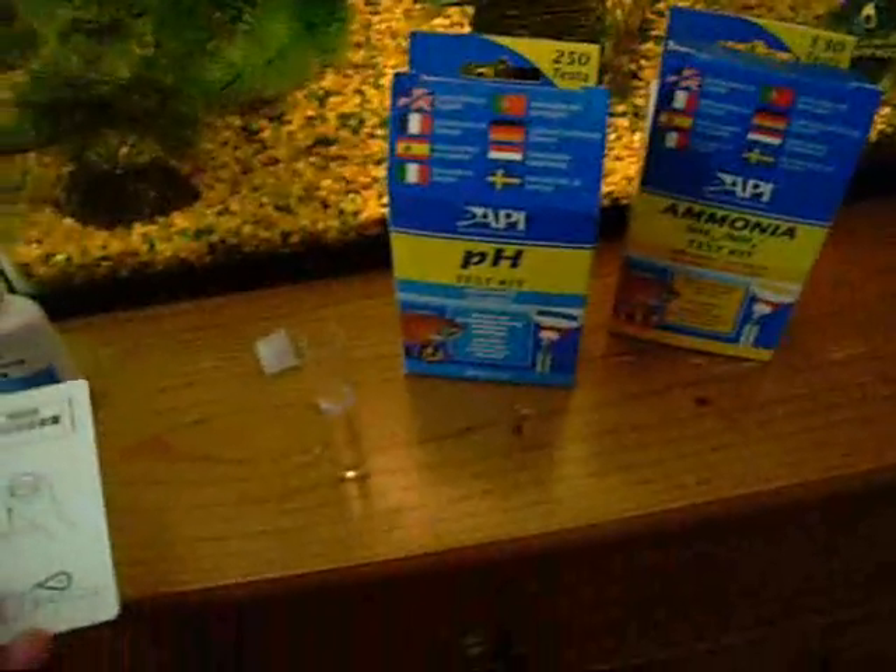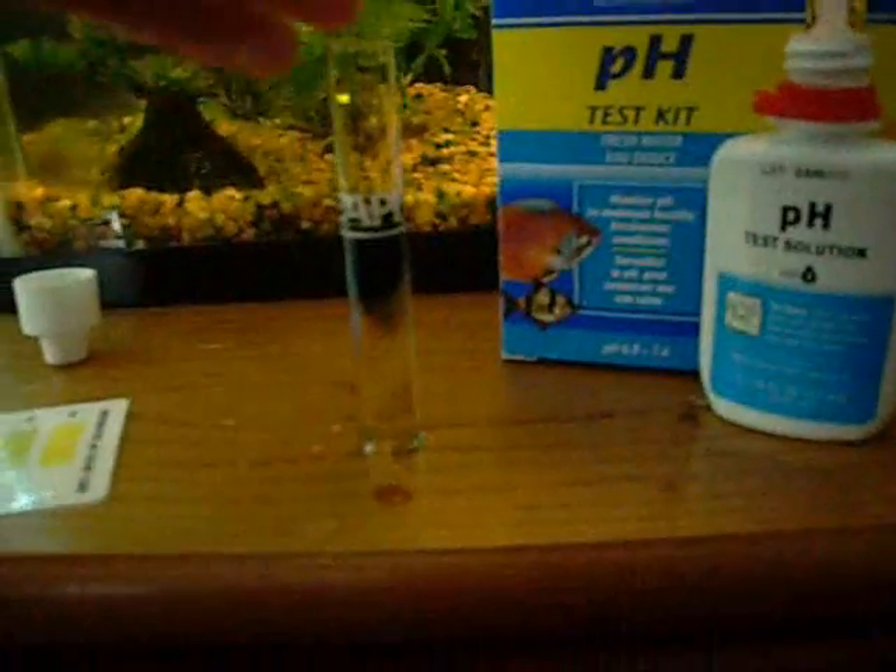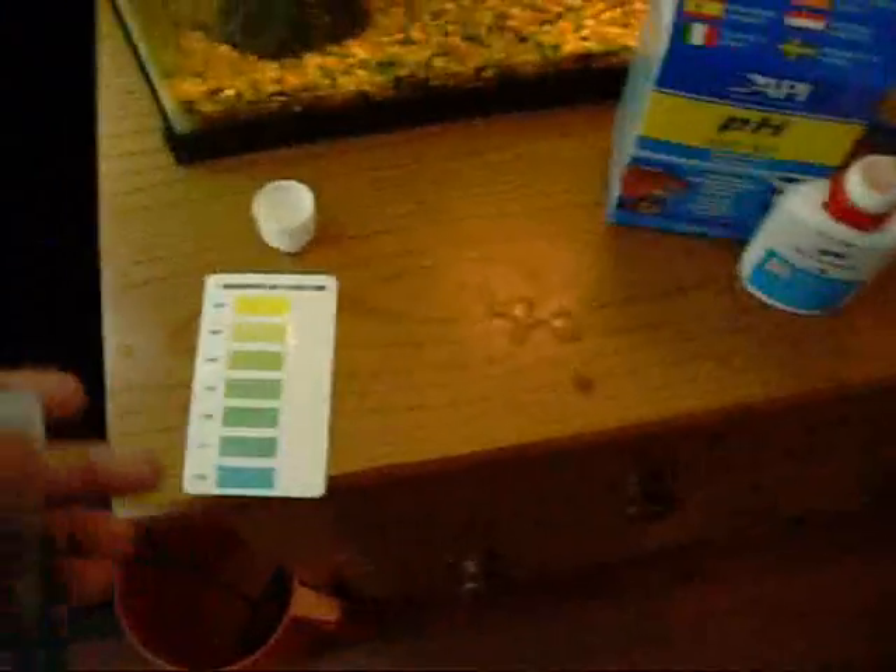Then you'll want to add three drops of the pH test solution. Put the cap back on and shake it for about 10 to 20 seconds.